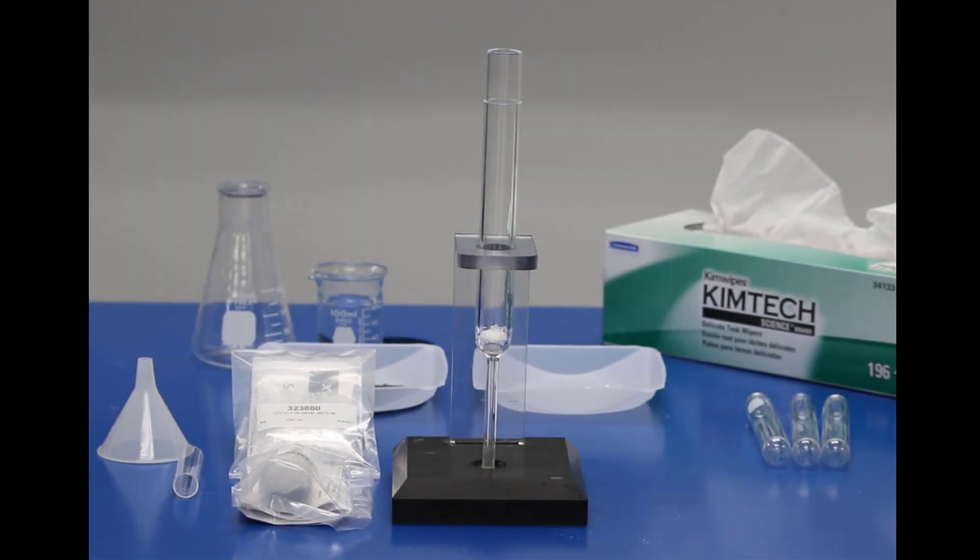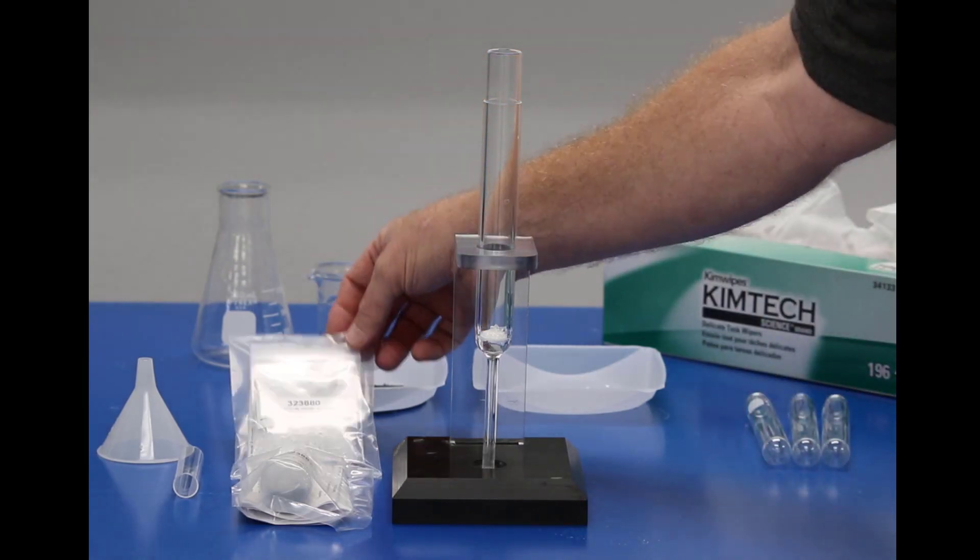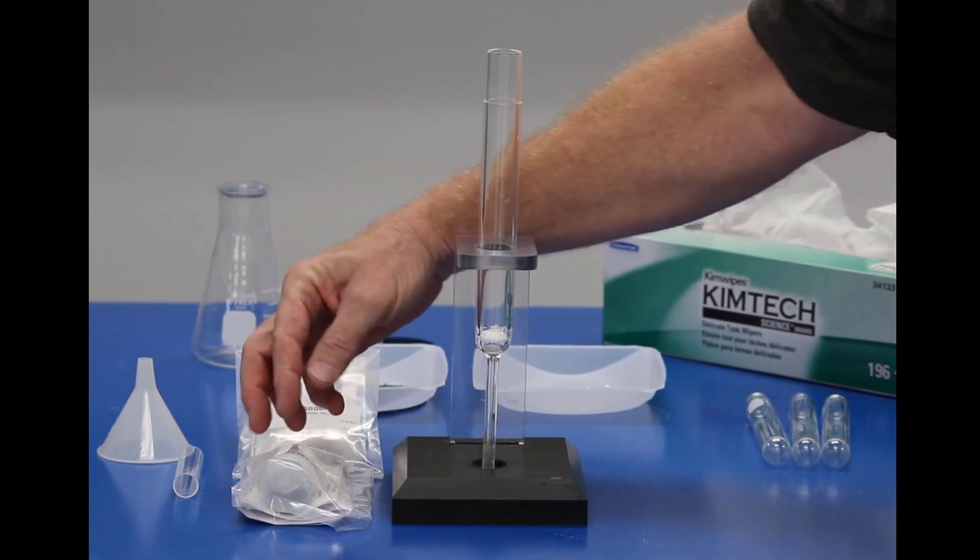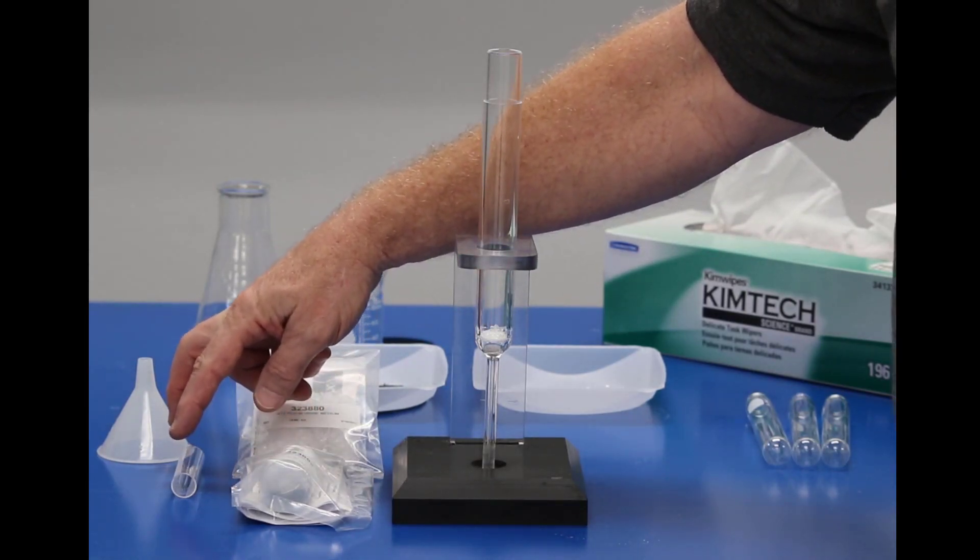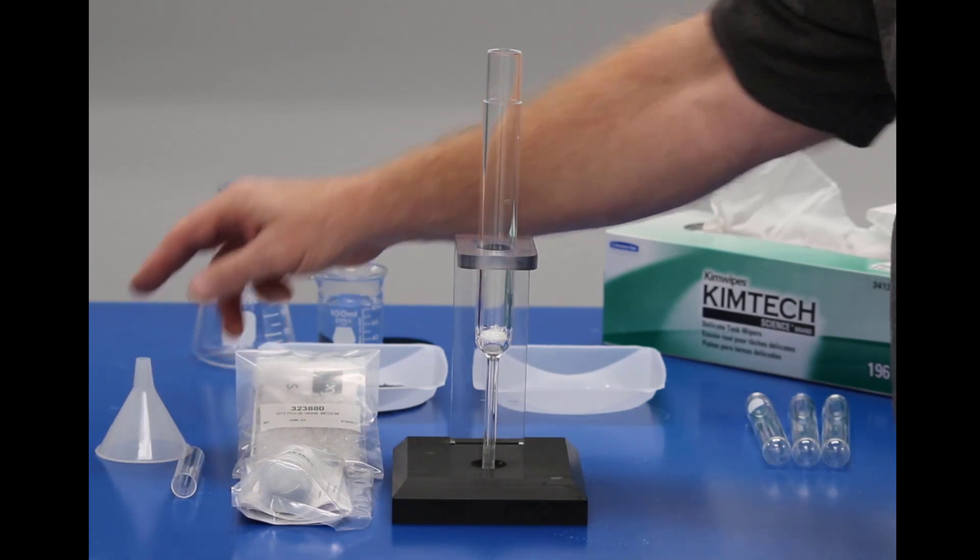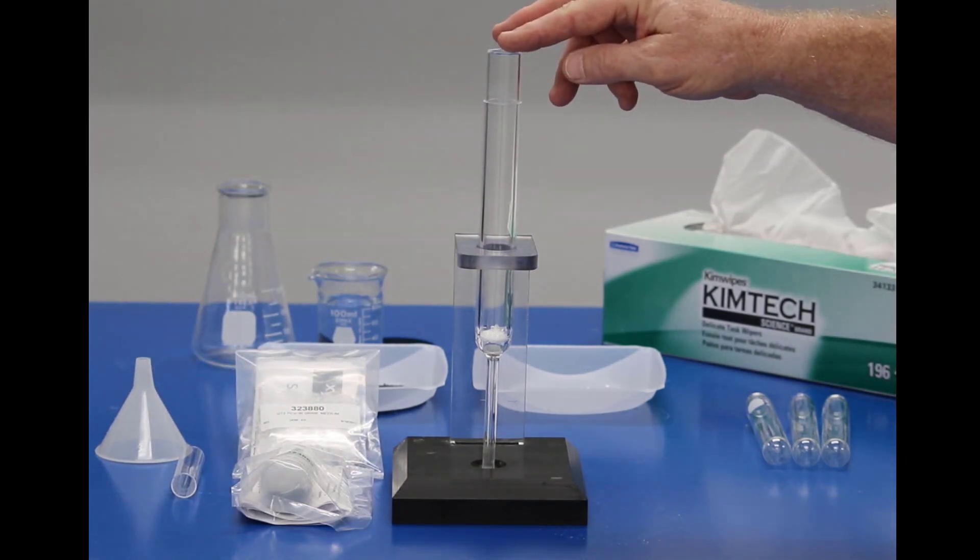I will now pack the combustion tube. In the startup kit you will find all of the material necessary for packing the tube, which includes quartz pieces, platinum catalyst, the combustion tube guard, funnel, and of course the combustion tube.